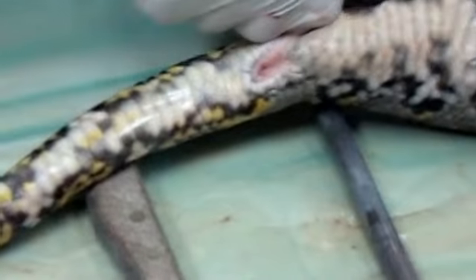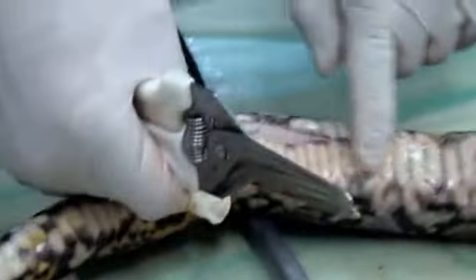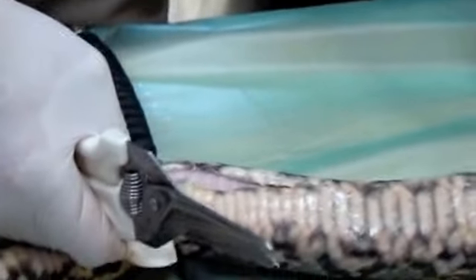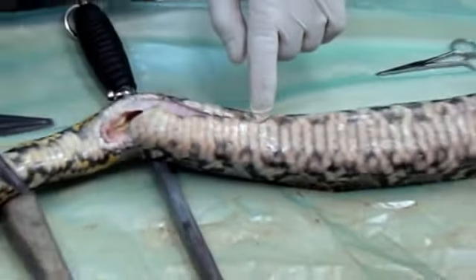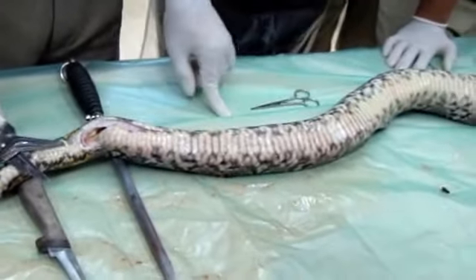Okay, and if you want to cut, we're going to let you take turns cutting. So, you see how we're cutting? These are the traction scales, the really long, rectangular looking ones. I'd love for you guys to cut along the seam here so that we can open up, because these are very valuable in the leather trade. So if we can just cut along the transition, I think we would do really well for them.